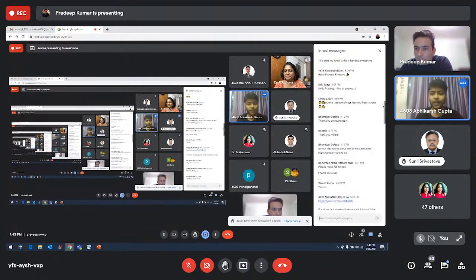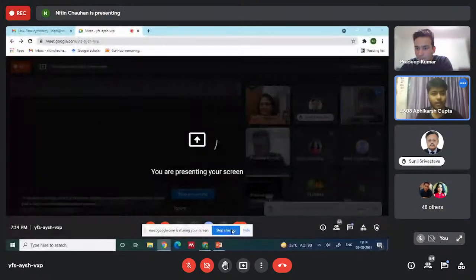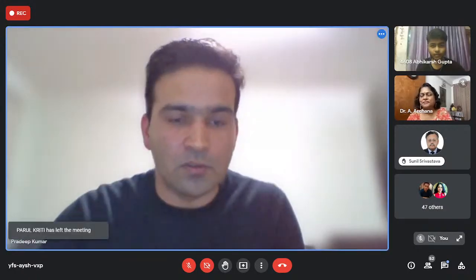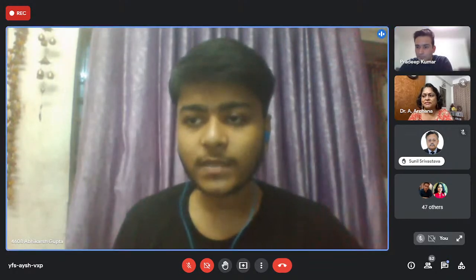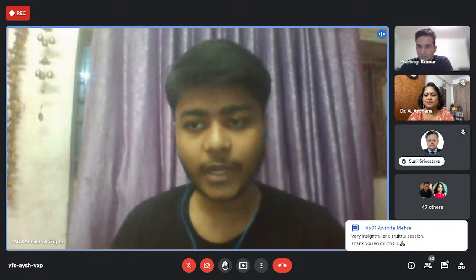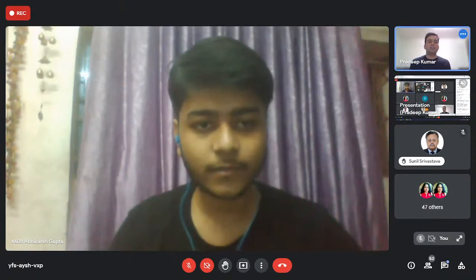Q&A session. So are you presenting something, sir? No, I'm not. I think I need to close the presentation probably. Yeah, so this first question is by Shivangi. She asks, while the sample is passed from between the sheath stream, how come the sheath fluid and sample do not get mixed up?